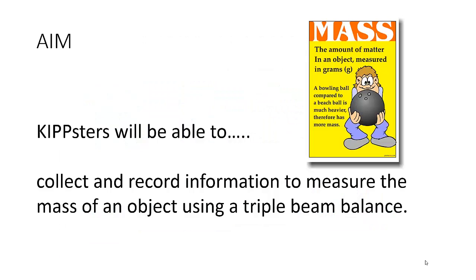Our aim for today, Kipsters will be able to collect and record information to measure the mass of an object using a triple beam balance. Yesterday we used meter sticks to take up information. Today we're going to use a triple beam balance to look at mass.